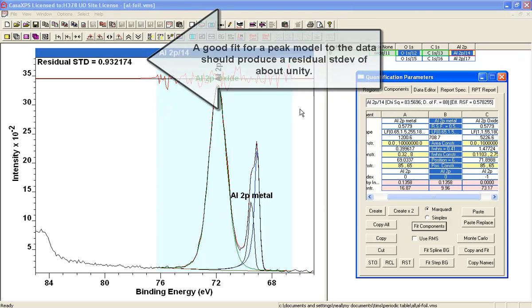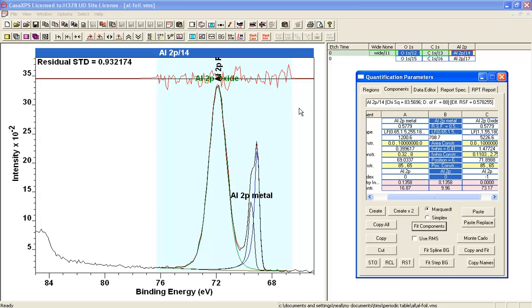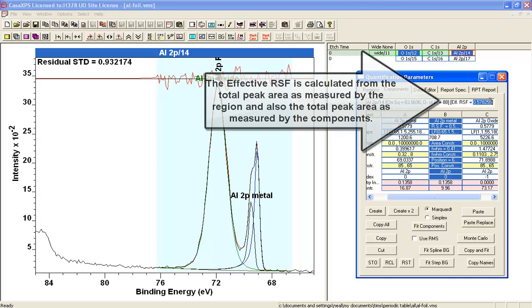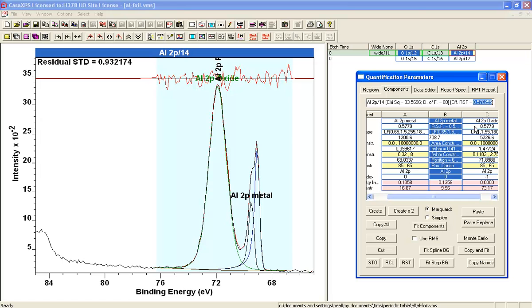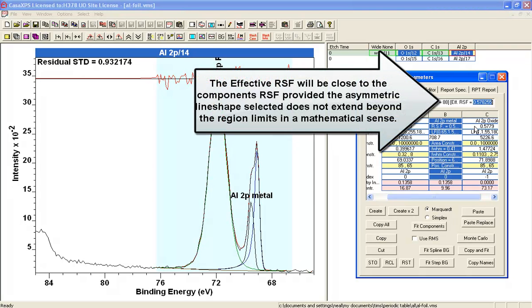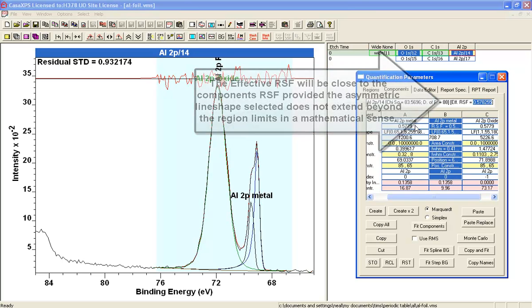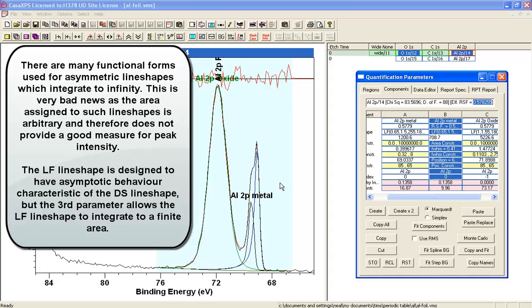So that now looks like a plausible peak model. The other thing to check is the effective RSF, which is calculated from the RSFs for the components and compared against the RSF that's used in the region. If this number here is turning out to be very close to the RSF, and it is, then your peak model is not only fitting well, but the line shapes within it are approximating the signal reasonably well too.